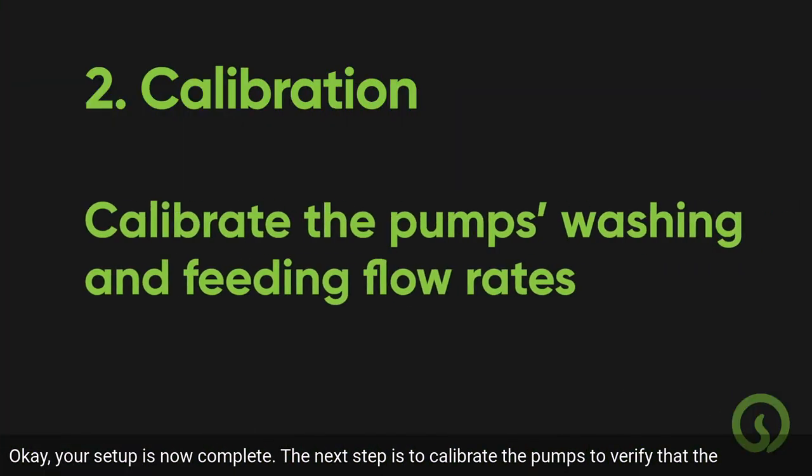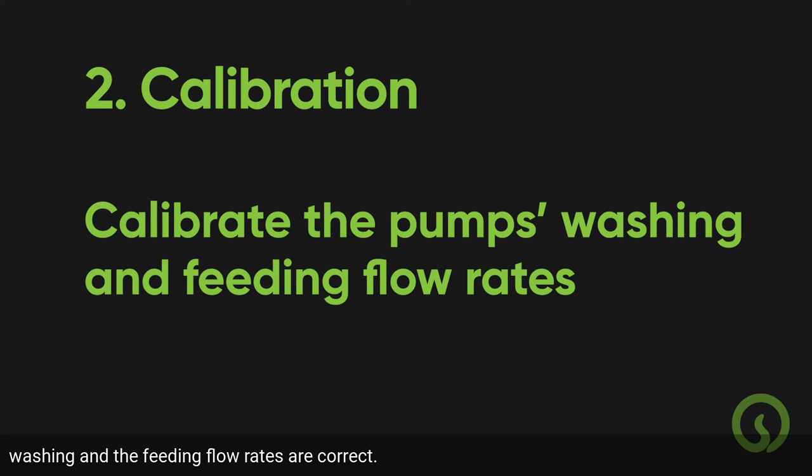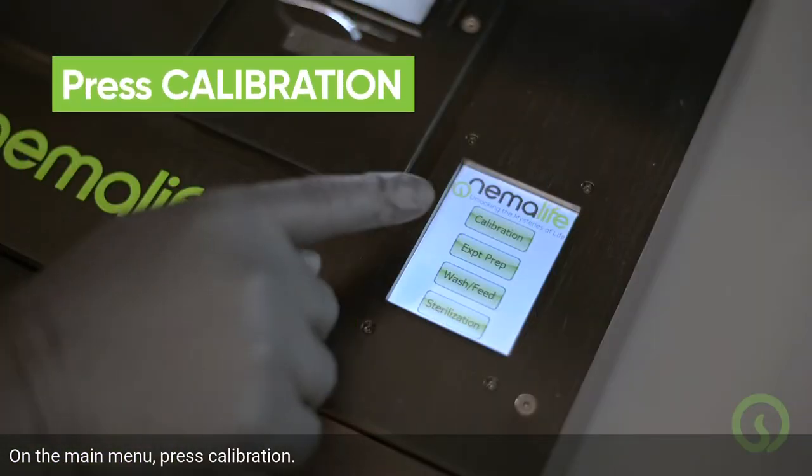The next step is to calibrate the pumps to verify that the washing and feeding flow rates are correct. On the main menu, press Calibration.